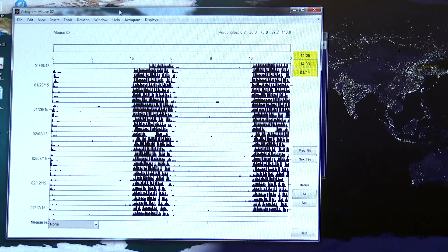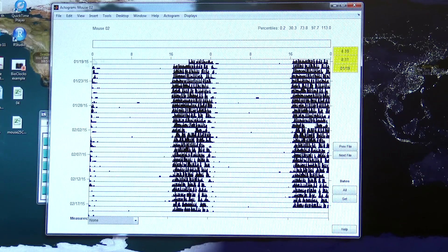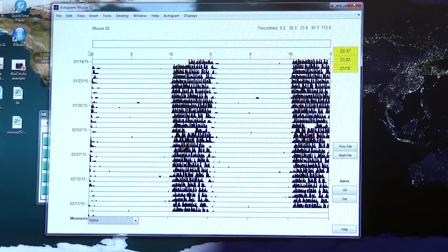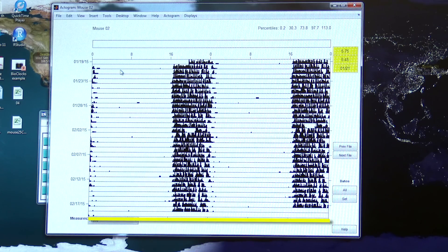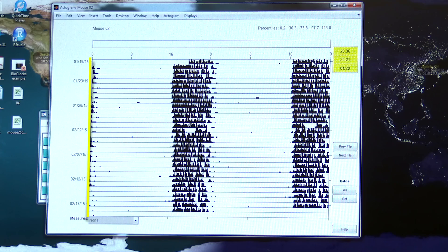What the actogram is doing is compiling all that data that's in six minute bins and displaying it across hours on the x-axis and across days on the y-axis.